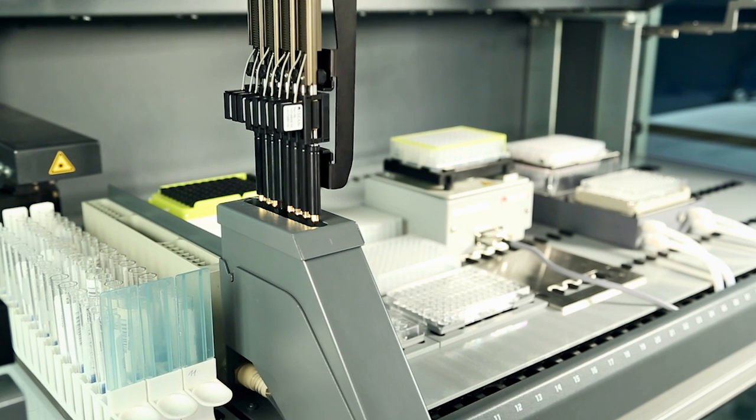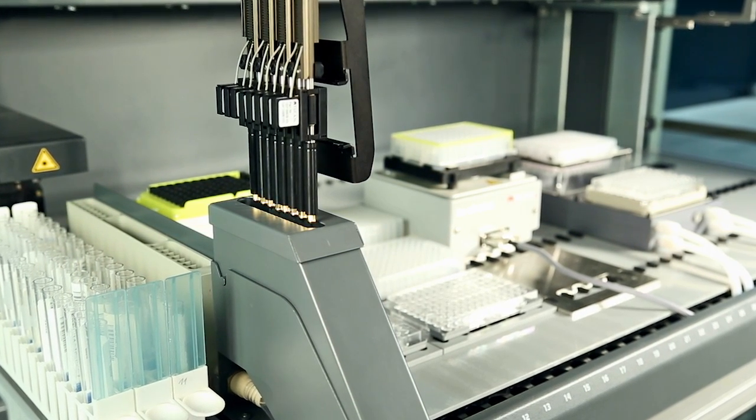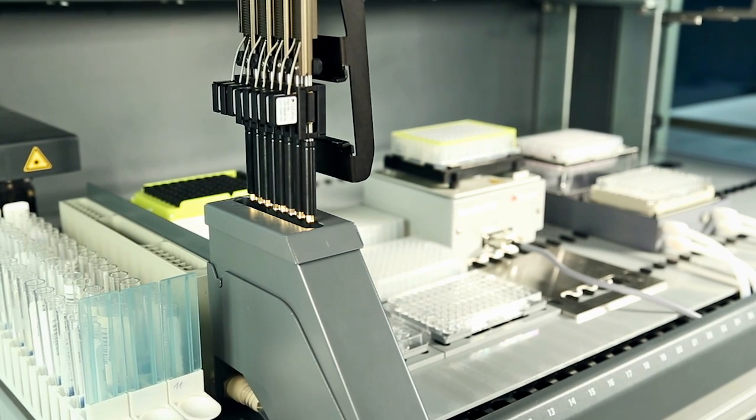Disposable tips can be automatically ejected into a waste chute or re-racked for further use, maximizing resource usage.